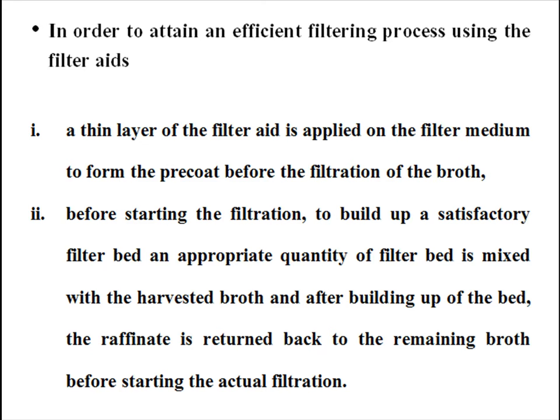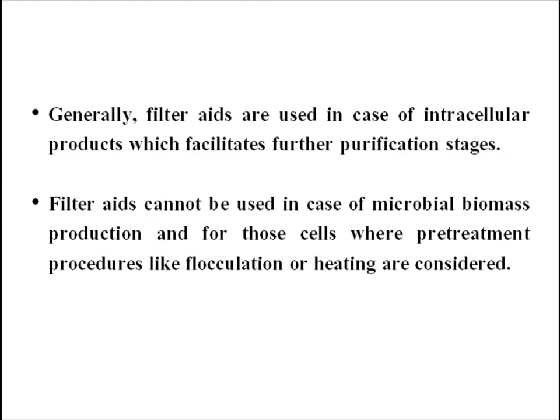In order to attain an efficient filtering process using the filter aids, a thin layer of the filter aid is applied on the filter medium to form the pre-coat before the filtration of the broth, to build up a satisfactory filter bed. An appropriate quantity of filter aid is mixed with the harvested broth, and after building up of the bed, the raffinate is returned back to the remaining broth before starting the actual filtration.